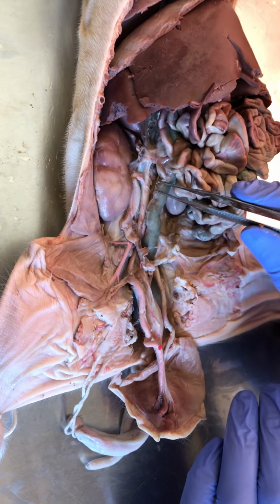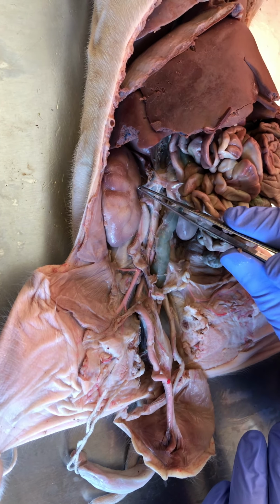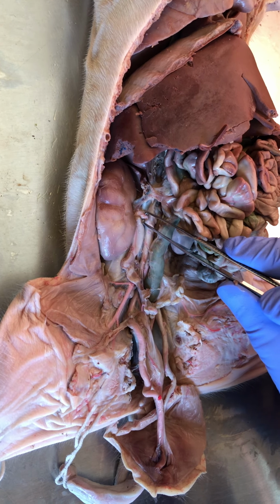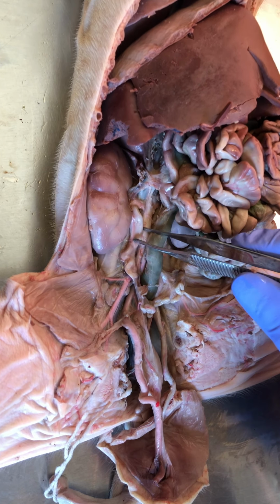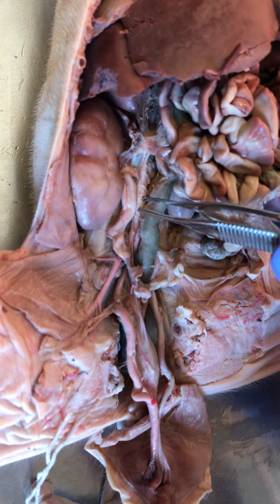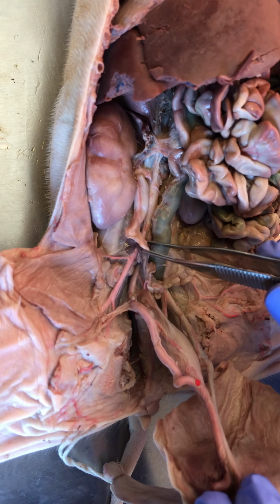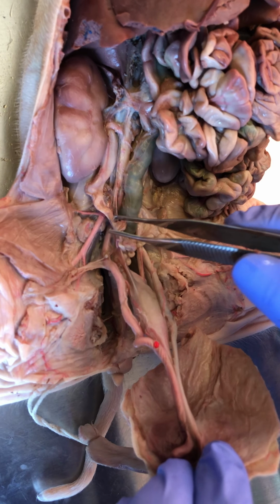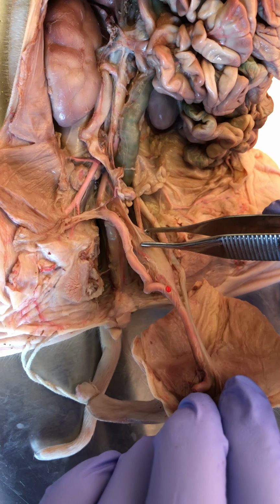As we already saw before, when you get to the medial aspect of the kidney, you're going to see the renal artery, the renal vein, but you're also going to see the structure draining the kidney, and that is the ureter. That's also exposed on the other side, but we're going to resist the temptation to flop back and forth. The ureter is going to drain, drip, drip, drip down into the urinary bladder.